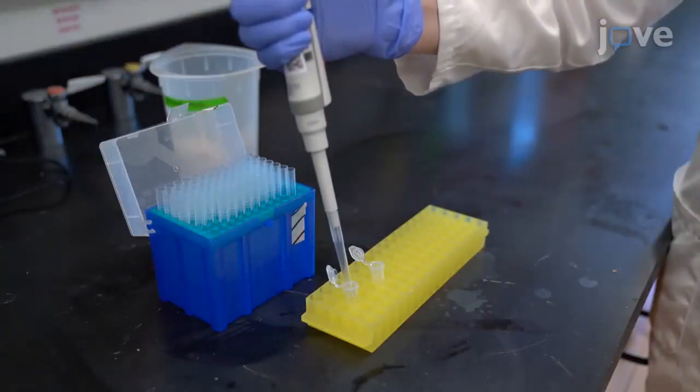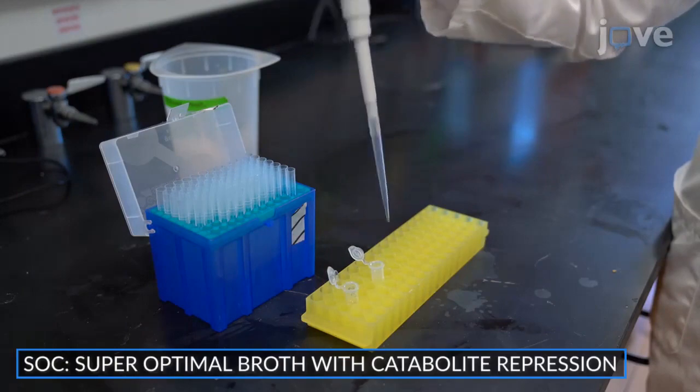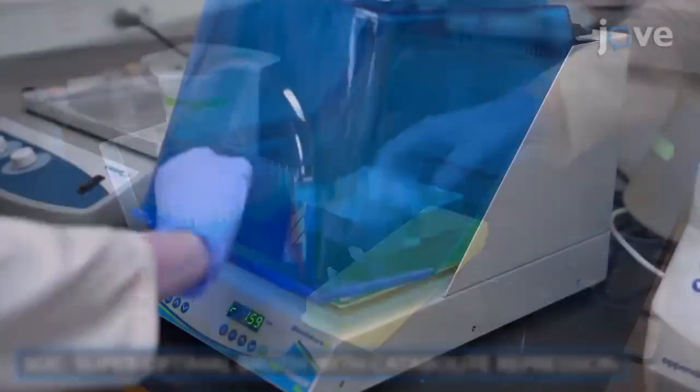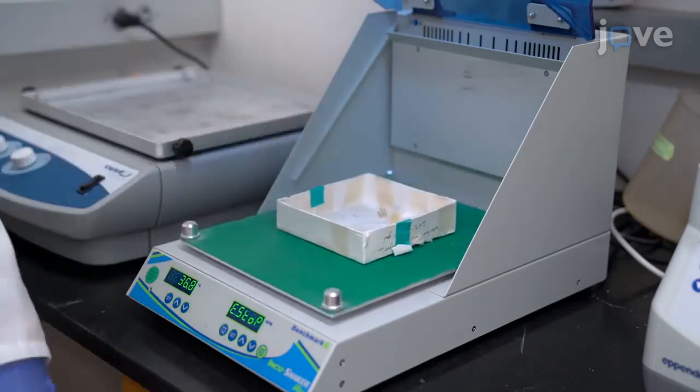Next, add 200 microliters of 37 degrees Celsius SOC medium to the tubes and incubate the cultures for 1 hour at 37 degrees Celsius and 200 rotations per minute.